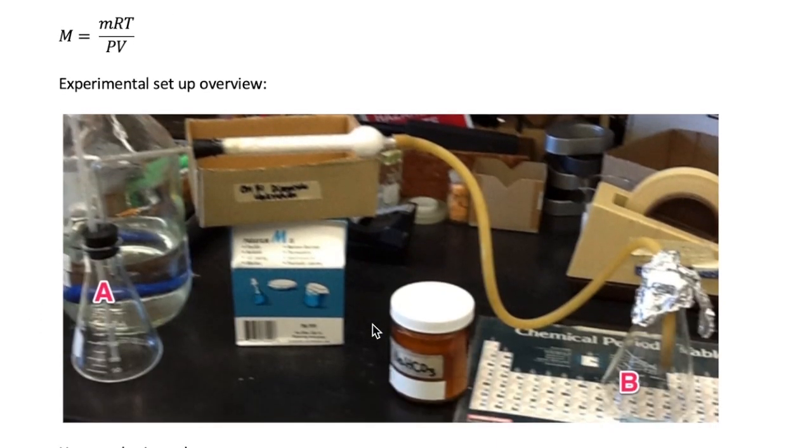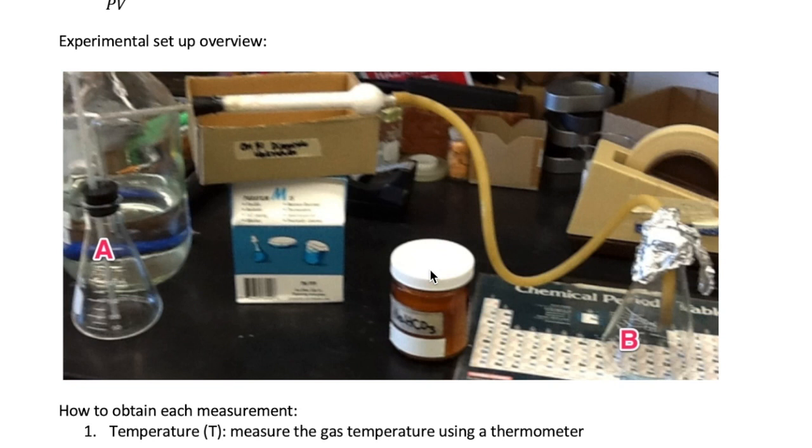Let's start with a brief overview of the experimental setup. You will carry out a reaction to produce your CO2 in the flask labeled A here, and you will collect the CO2 gas in the flask labeled B. Later I will discuss what all the different parts are, but right now I just want you to understand that the gas will be collected in an Erlenmeyer flask.